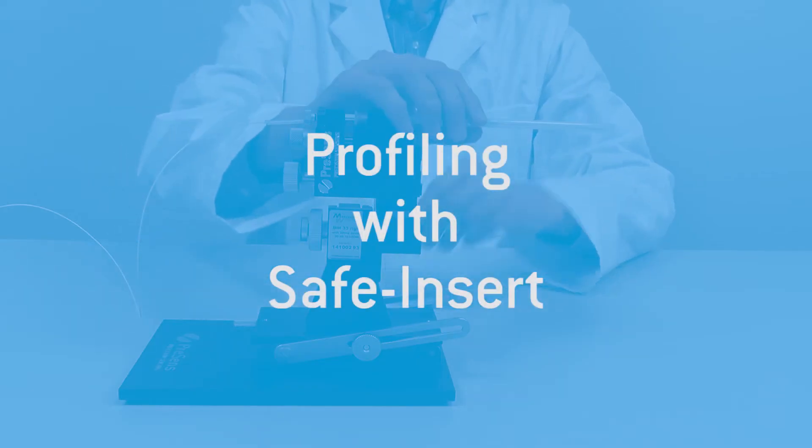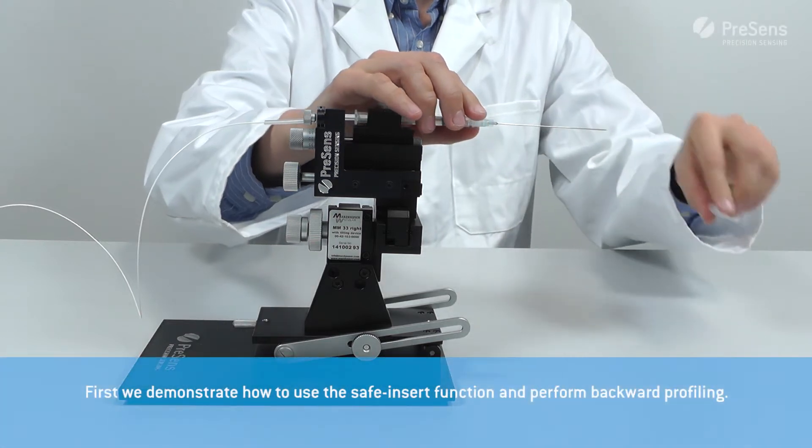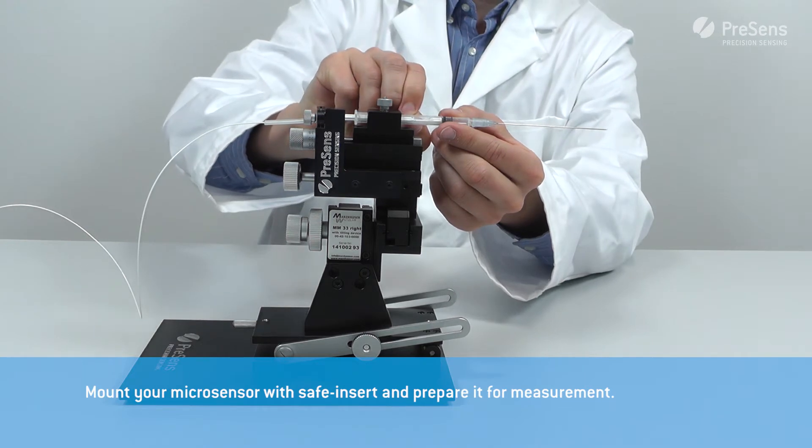This video shows how the manual micromanipulator can be applied for profiling. First we demonstrate how to use the safe insert function and perform backward profiling.